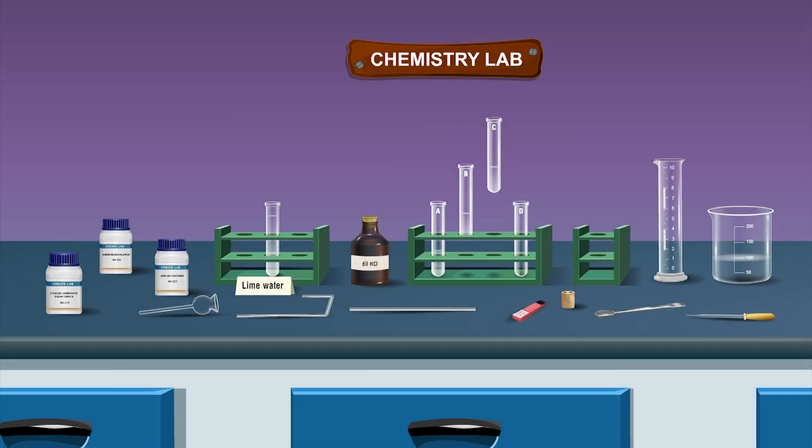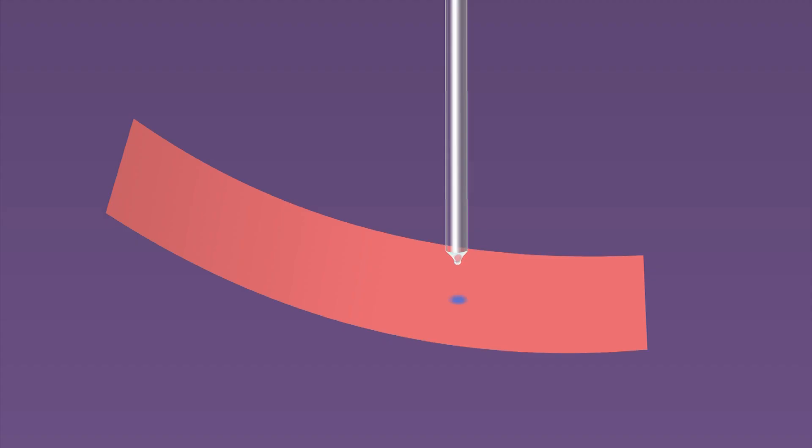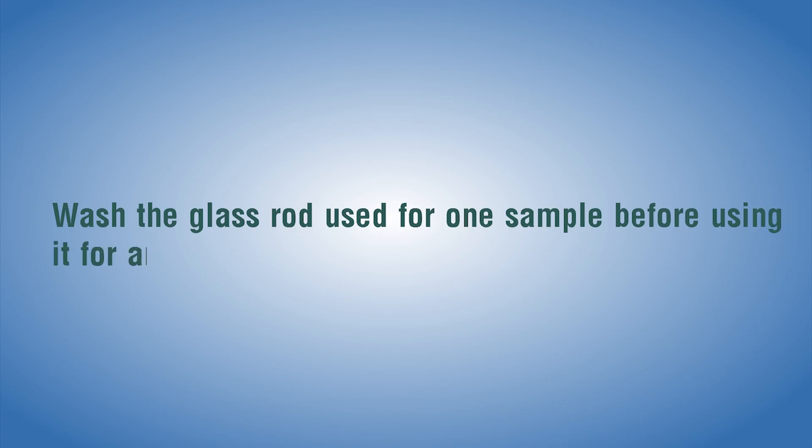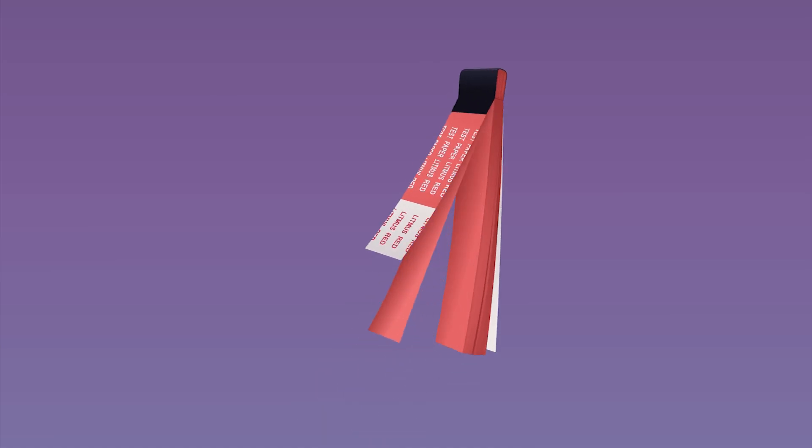Now transfer a drop of every salt solution of sodium carbonate decahydrate, ammonium chloride, and sodium chloride one by one on a separate red litmus paper strip using a glass rod. Precaution: wash the glass rod used for one sample before using it for another sample. Observe if any color changes occur in the litmus paper.